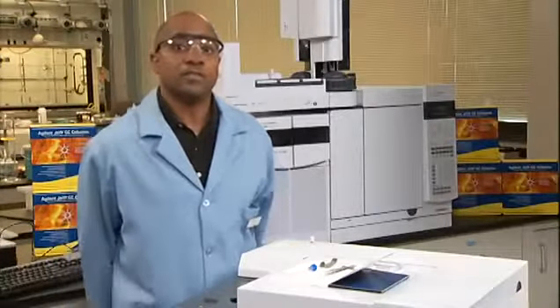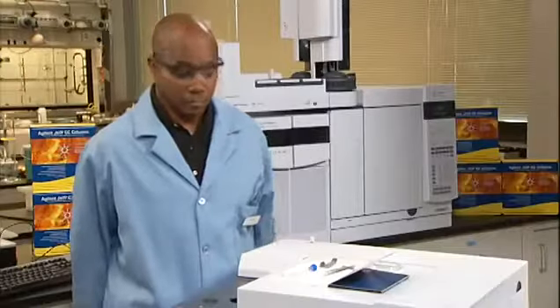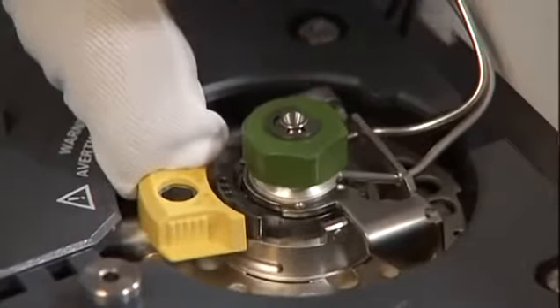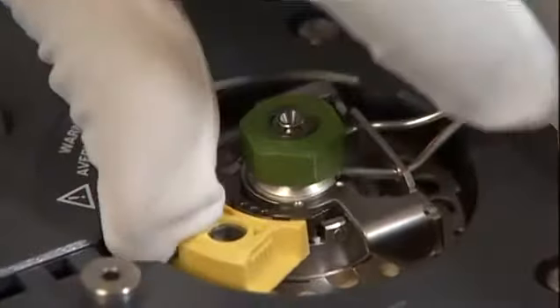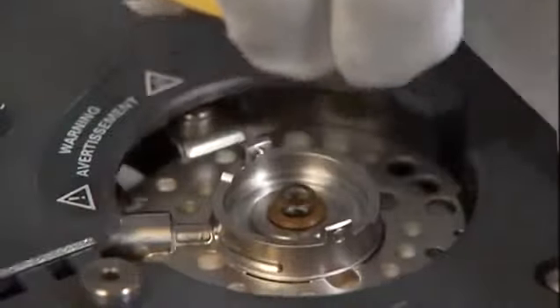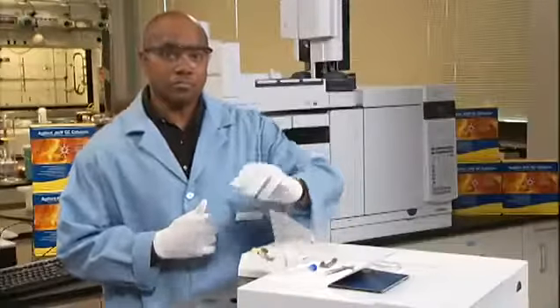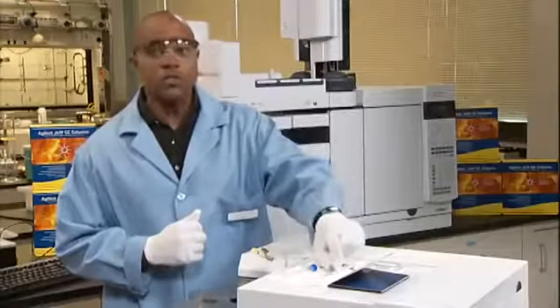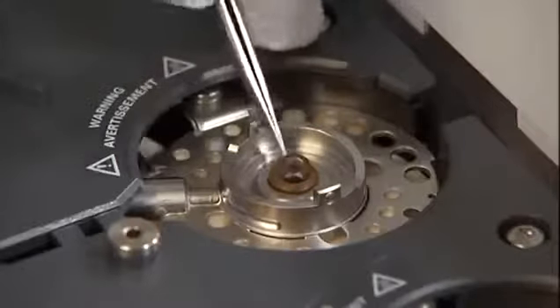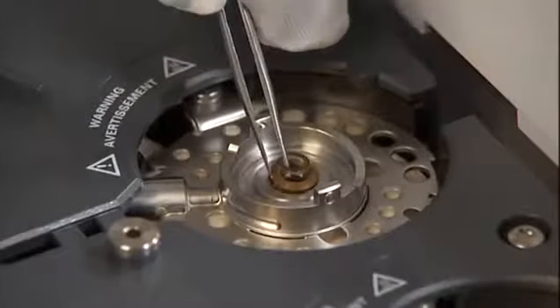Next, we'll replace the liner and the o-ring. Slide your locking tab forward. Lift the septum retaining assembly straight up and away from the inlet to avoid chipping or breaking the liner. Loosen your o-ring from the seal surface with your tweezers, then grasp the liner with tweezers and pull it out.